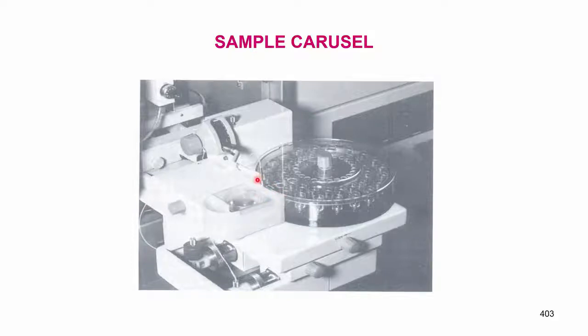And then again when it is ready, the robotic arm will lift and move on to some other position, pick up the sample and redo the analysis. That means the whole auto operation of atomic absorption can be automated without any human interruption.